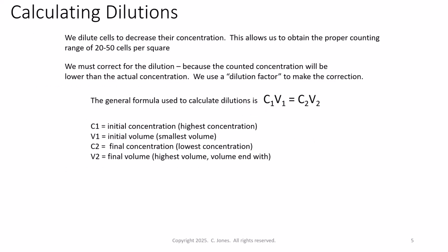These next two slides, though, you should take a minute with, because invariably I find that my students struggle with dilution factors, even the ones who come to us with 4-year degrees, master's degrees, and PhDs. So first thing is, why do we need to dilute when we do cell counting, right? Because we need to have the counting range of 20 to 50 cells per square.